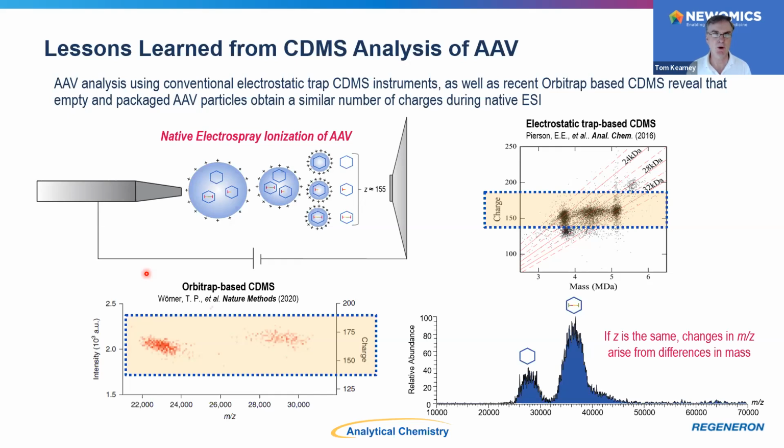Okay, great, thanks. Two more questions. All right, so this one is apparently a reply to one of your earlier answers. Reply to your response of the 45,000 mass charge assignments: do these signals go away if you don't use the charge reducing agent? Yeah, so they're not as defined, but even in this case here, where we're not applying our charge reducing setup, you can see that there's a little bit of this tailing feature here. So it just so happens that we're on a good example here.